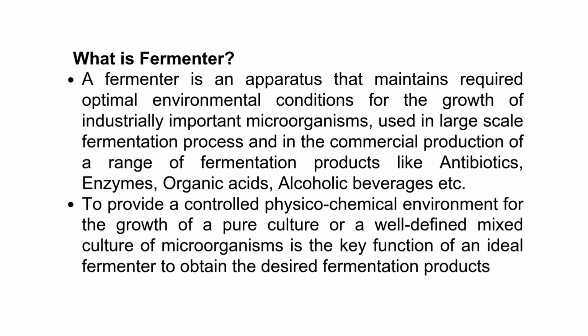A fermenter is an apparatus that maintains the required optimal environmental conditions for the growth of industrially important microorganisms. It's used in large-scale fermentation processes for the commercial production of a wide range of products like antibiotics, enzymes, organic acids, and alcoholic beverages. The key function of an ideal fermenter is to provide a controlled environment for the growth of a pure or well-defined mixed culture of microorganisms to obtain the desired products.